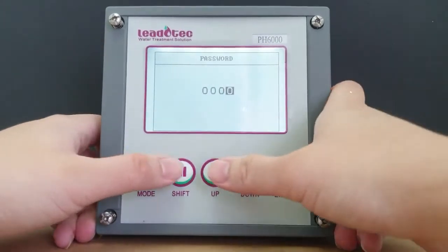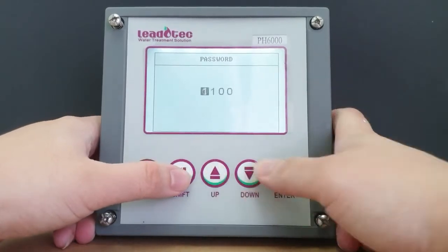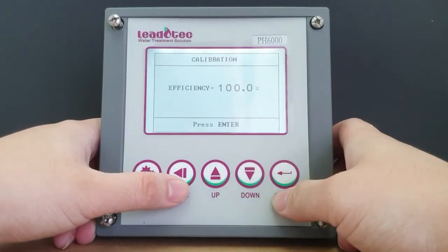So to begin, press mode once, enter the password and go for automatic calibration.